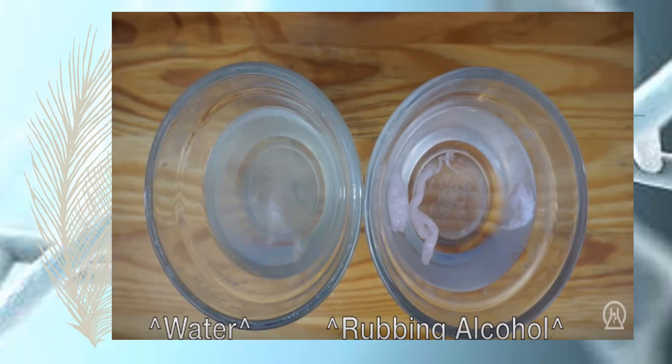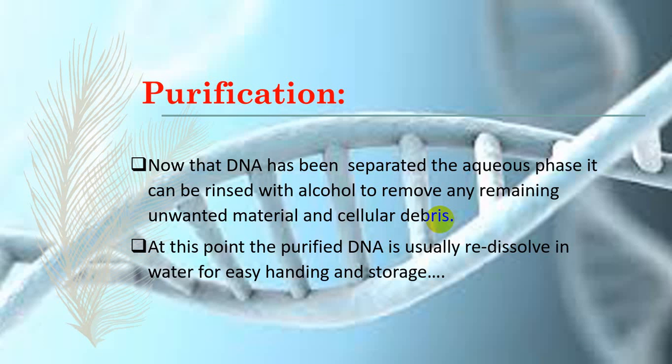On the left side you can see the cloudy water. This is the DNA in water, and in the second you can see rubbing alcohol. So this is alcohol, and the white thing over here is the DNA in alcohol. So purification, the last step, is the purification.